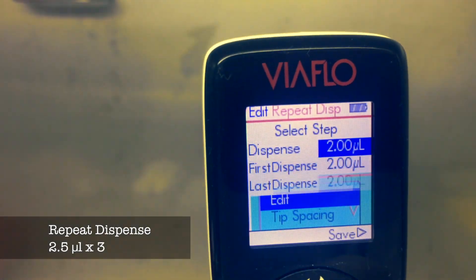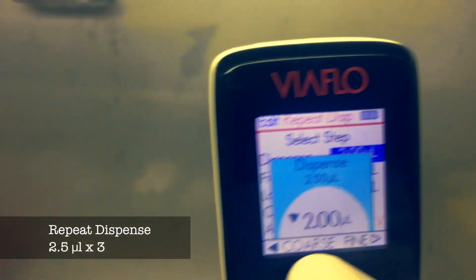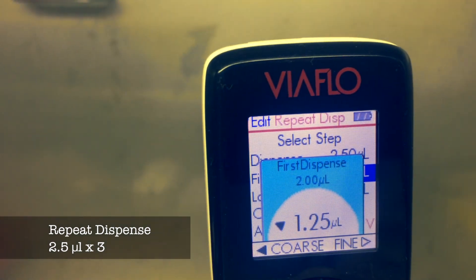Now I need to set the VioFlow Voyager pipette to repeat dispense 2.5 microliters in triplicate.